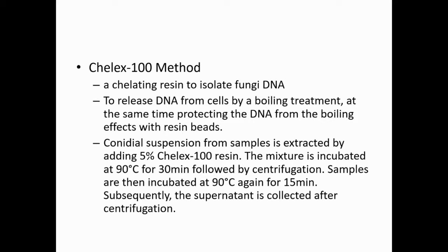So this method is quick to obtain DNA from spores. That's Chelex 100.